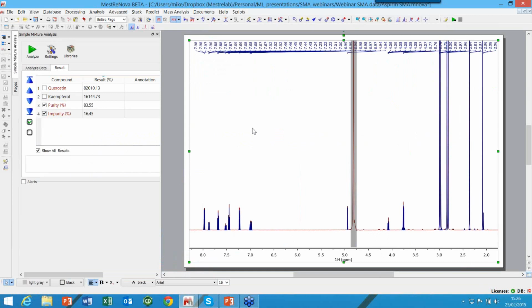Here we go. So here's a spectrum of aspirin C in D2O. A presat has been used to remove most of the water peak, and there's a bit of a residual nasty lump there, which I've made a blind region around just because I'm a bit fussy about these things. I've done the peak picking already.